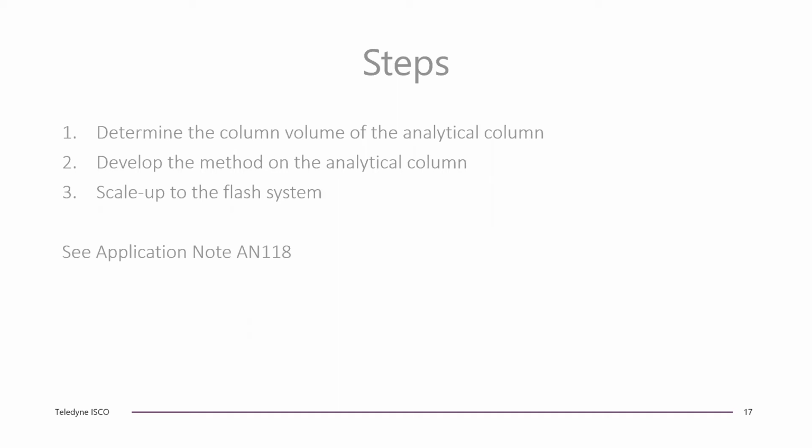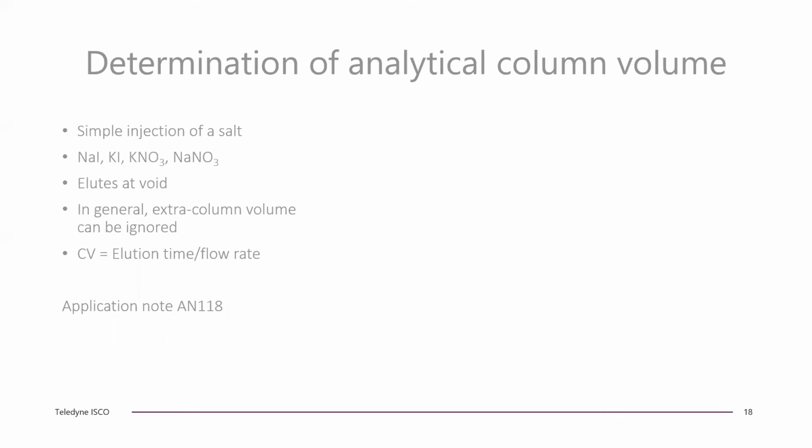Columns of the same length and inner diameter are sufficiently close in column volume for our purposes. Next, develop the method on the HPLC. Finally, scale up to the flash column. Application note number 118 describes the scale up. Sometimes the column manufacturer lists the column volume.